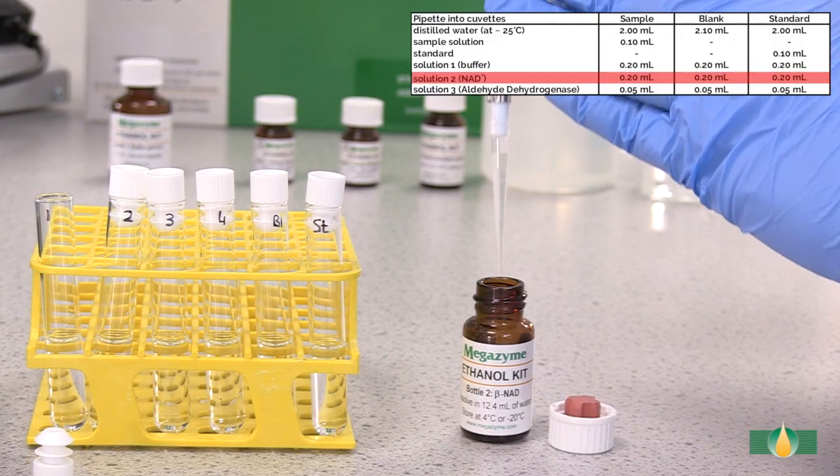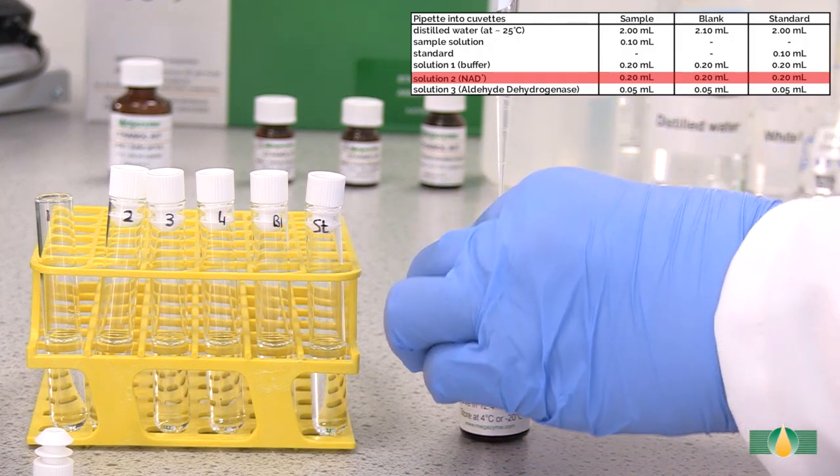Add 0.2 milliliters of solution 2 into all assay tubes.